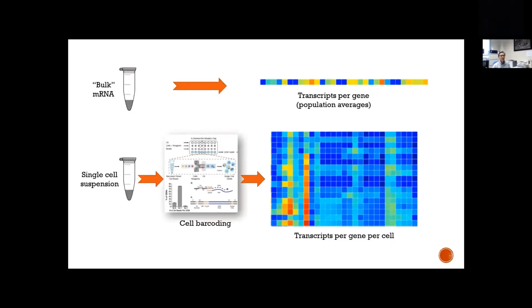As I said, there is a huge impact on biological and medical research because this provides single cell level readouts for the signal from individual cells, which we couldn't do previously. So before single-cell genomics technology became commercially available, most people used so-called bulk RNA sequencing to measure gene expression level in your sample.